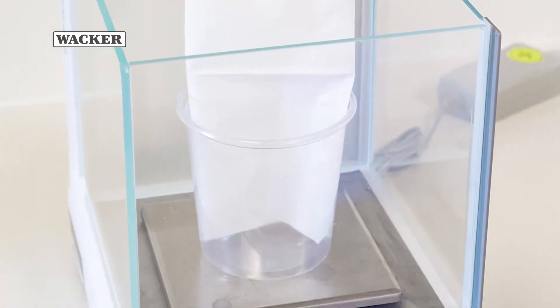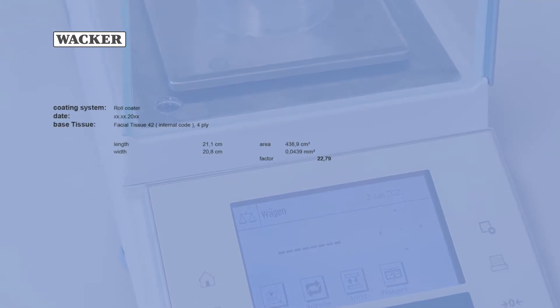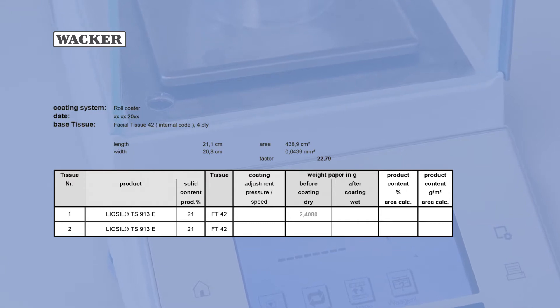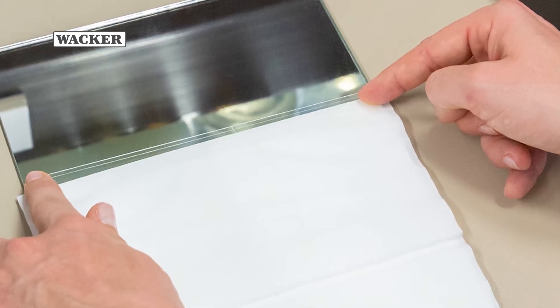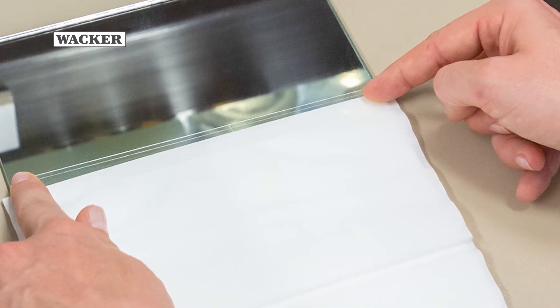First, the tissue fabric is weighed on an analytical balance. This allows the exact amount of lotion coated onto the tissue to be determined after roll coating. If a support plate is needed for coating, as in the present case, the tissue is then bonded to it.